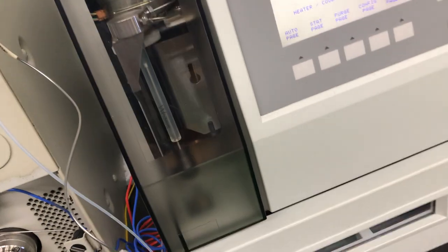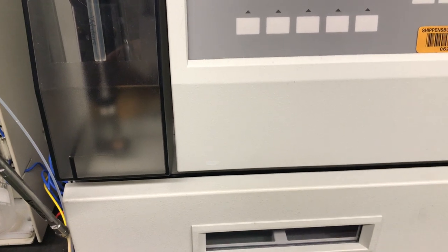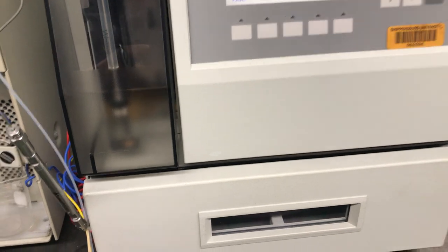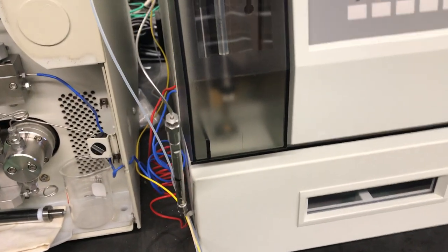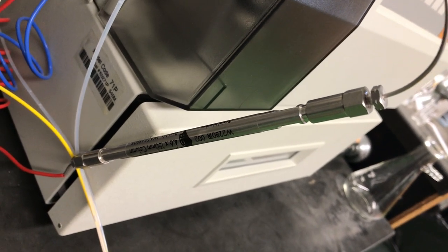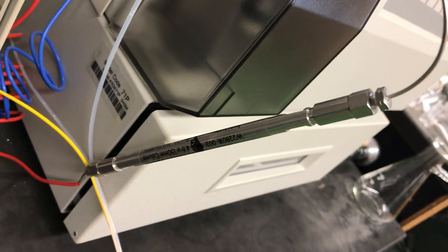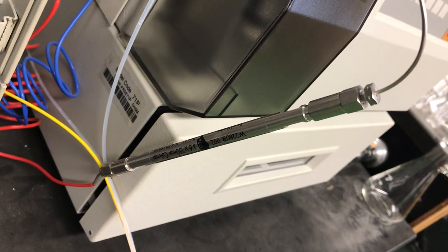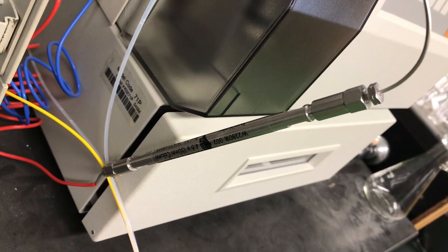Inside the Auto Sampler is the actual injection region, where some of the sample can be drawn up into a low-volume sampling loop, which is then placed as a plug into the path of the mobile phase. That plug is then introduced to the column, where the separation itself of a complex mixture takes place based on interactions between the analyte and either the mobile phase or the stationary phase.